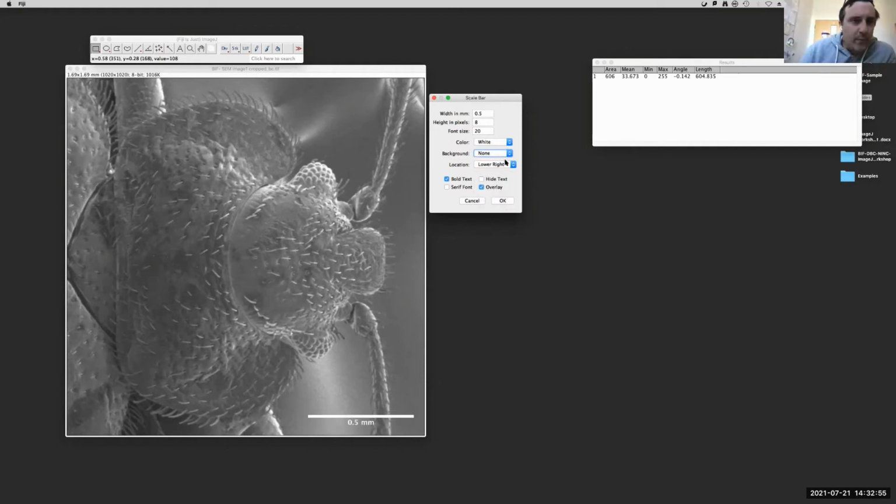Nikki? Yep. There's a couple of people that are getting pixels as the units on their scale bar. Oh, okay. Maybe you can go over setting the scale again. Right. I think that might be the issue. Okay.